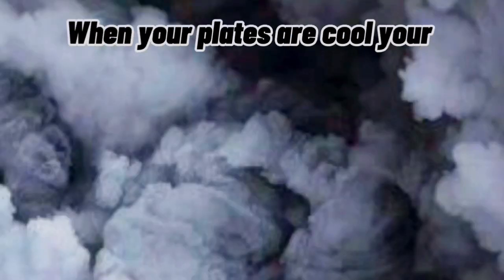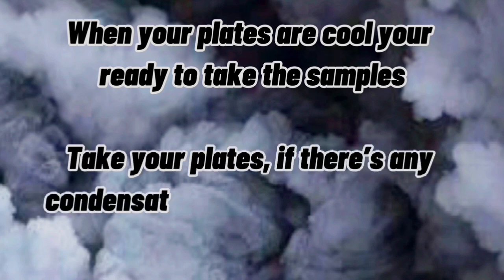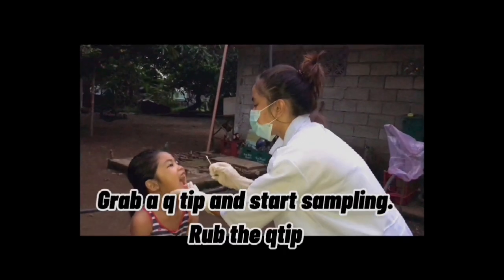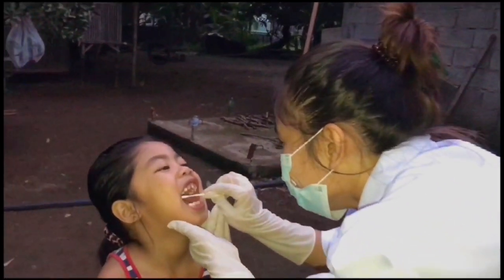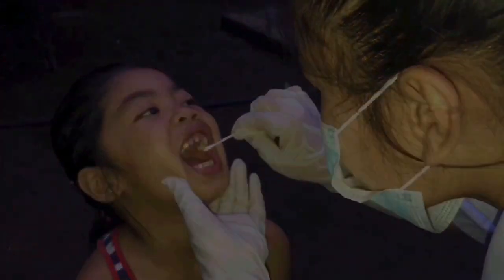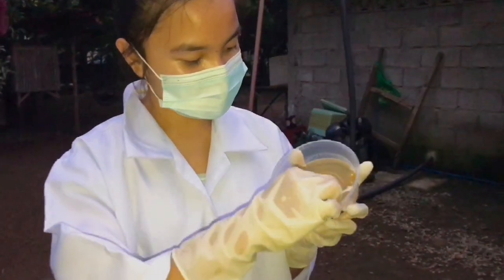When your plates are cool, you're ready to take the samples. Take your plates — if there's any condensation or water inside, just wipe it up with paper towels. Grab a q-tip and start sampling. Take the q-tip that you use and gently swab it on the plate.